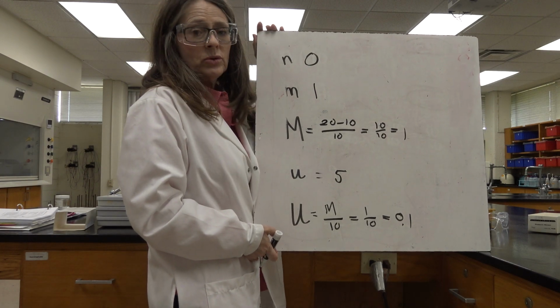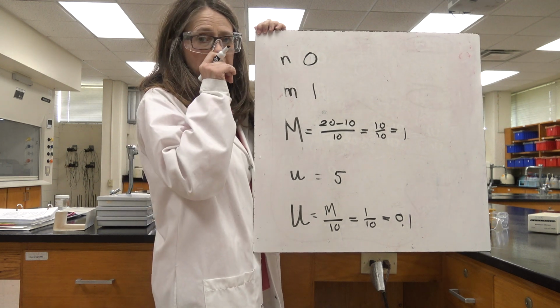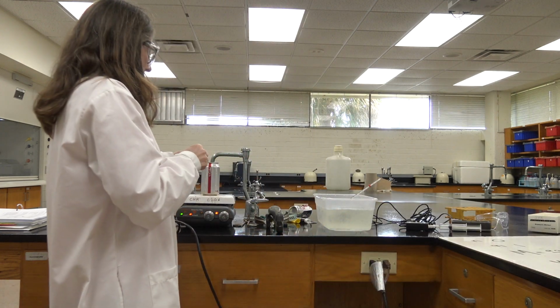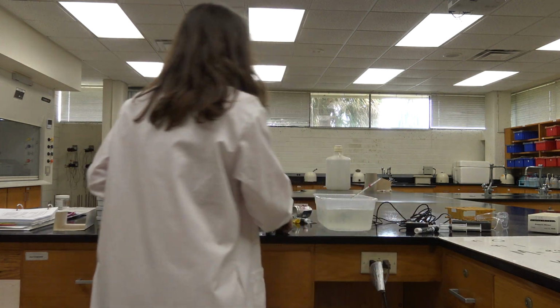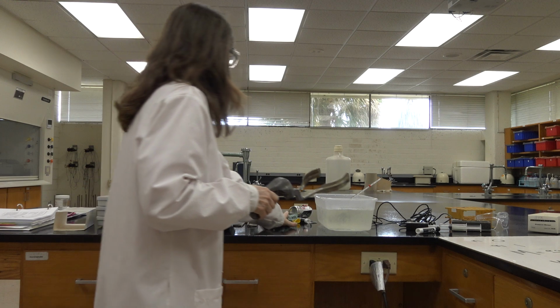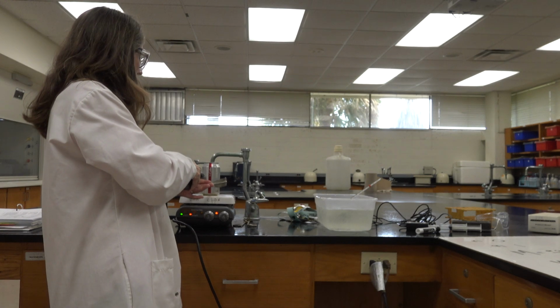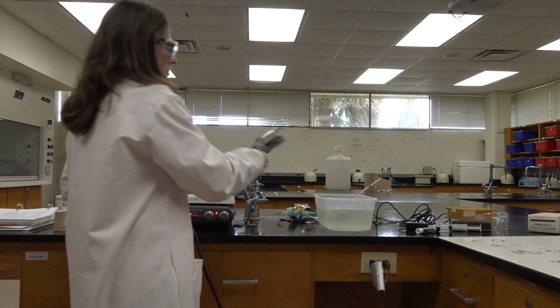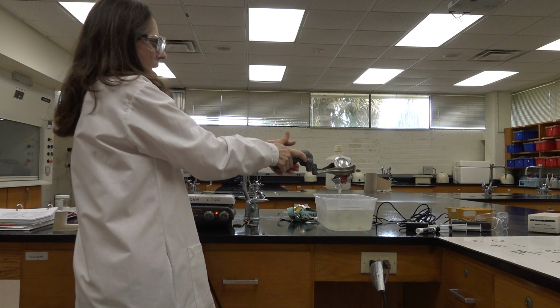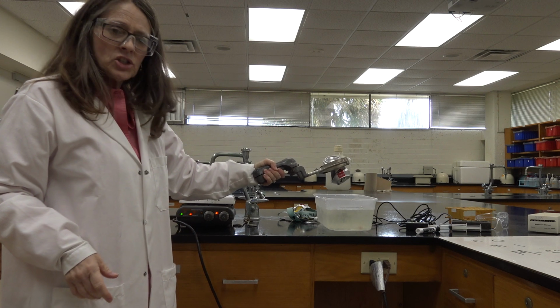Here's the NMMUU you need for the temperature of the water bath for experiment 2 of the gas laws lab. Now I'm going to take my gas, which is filling up in the can, and I'm going to cool it to the temperature of this water bath, and you're going to make an observation. Ooh, and something rather dramatic happens. The can crushes. And we need to talk about that a little bit.